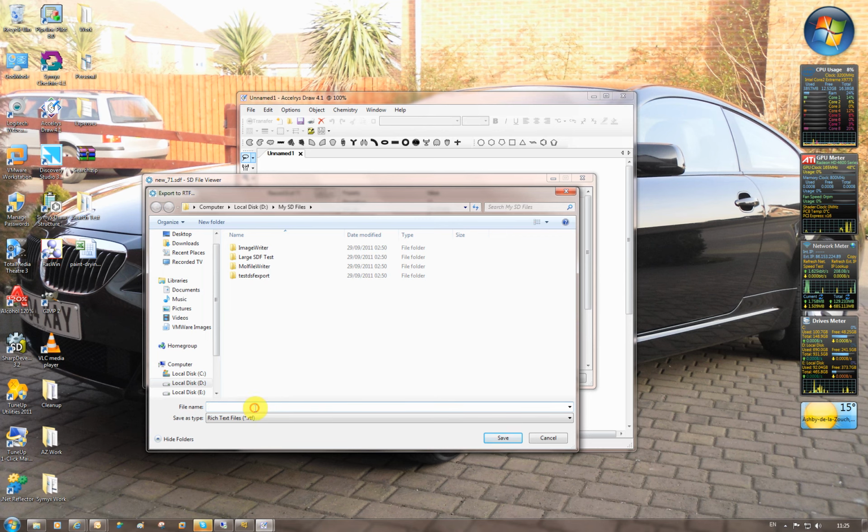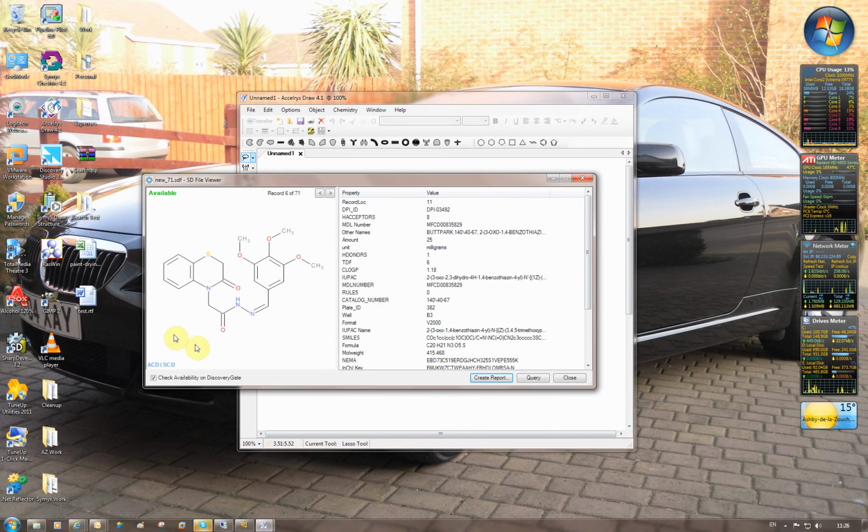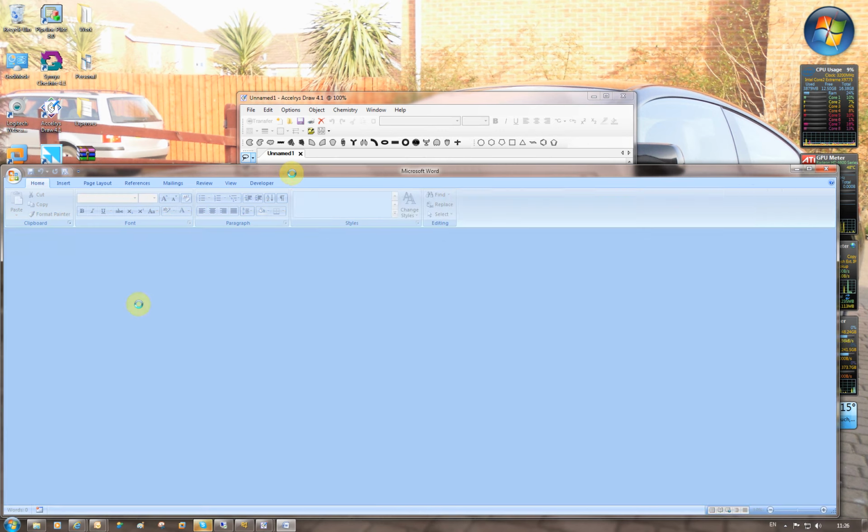So it's finished, and now we can save that report. I'll put it on the desktop, and save. So there, that will open in Word.